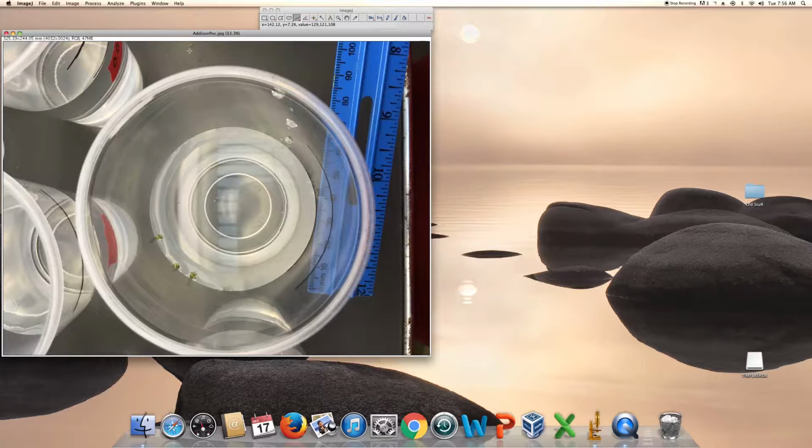These are pretty small though, so it's kind of hard to see in this photo here, so we're going to want to zoom in. To make zooming in easier, I would first start with your rectangle. Just draw a little rectangle from the toolbar up here and just kind of circle the duckweed like this. Now, this is when you want to zoom in. There are different ways to zoom in. You can use the plus minus sign to zoom in and out.